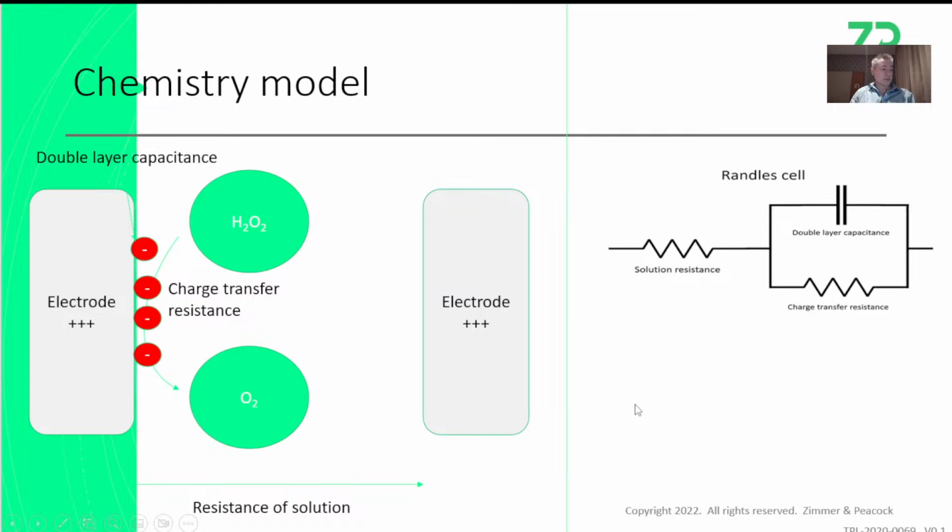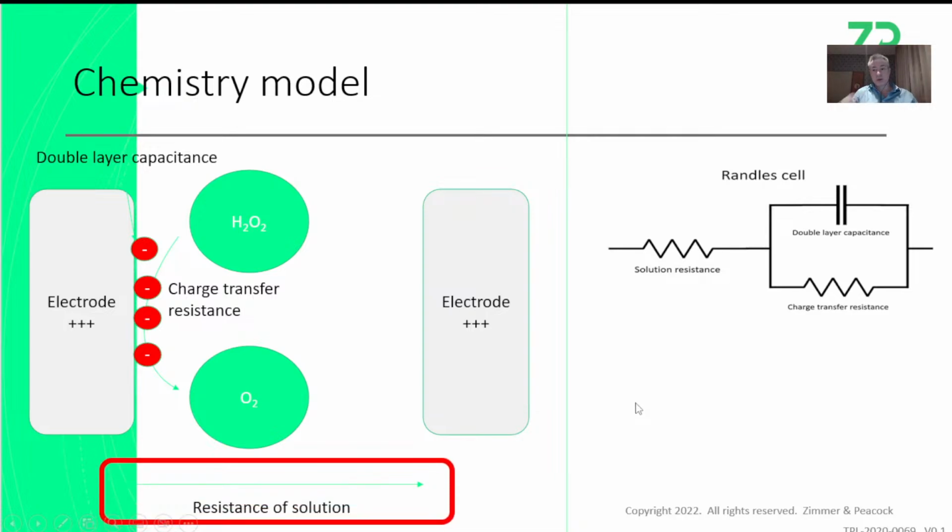This is something that we do cover in the workshops, but they want to know the conductivity, from which they can probably measure the salinity of the solution. We use a technique in electrochemistry called impedance spectroscopy to measure the conductivity or the resistance of the solution, and therefore you can calculate the salinity.